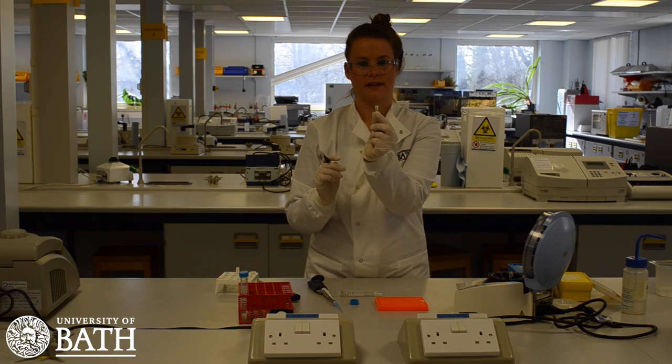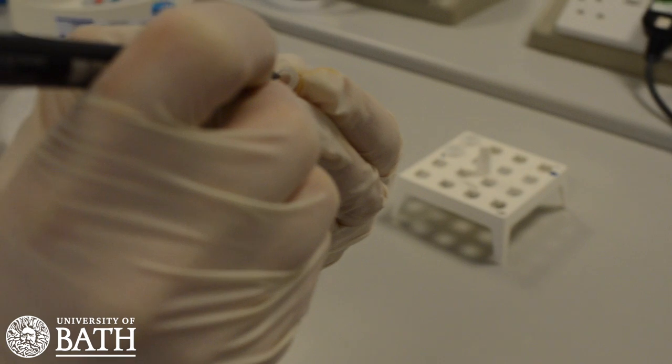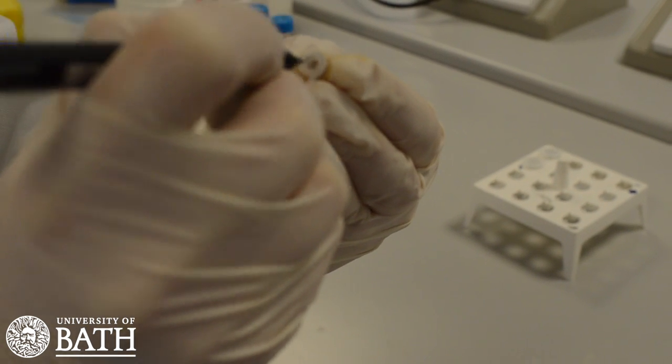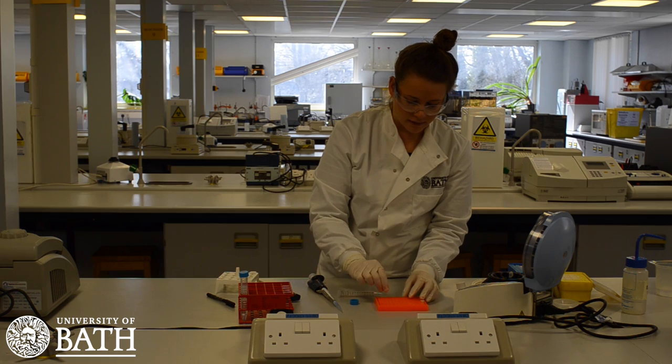Begin by taking a thin-walled PCR tube and labelling it with your initials. This will ensure that the PCR samples from different students do not get mixed up later in the experiment.